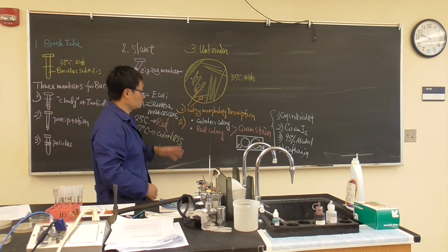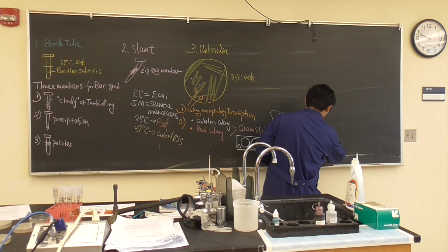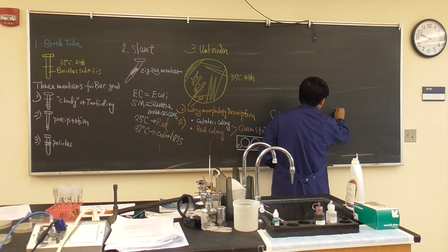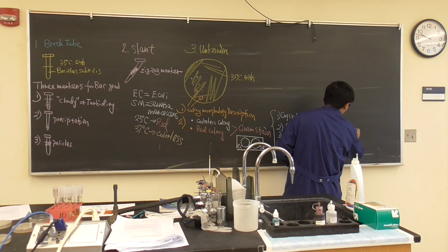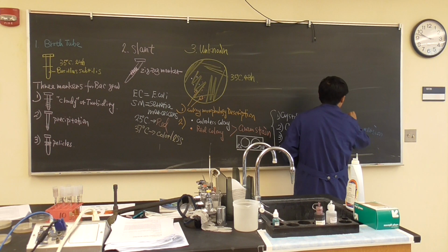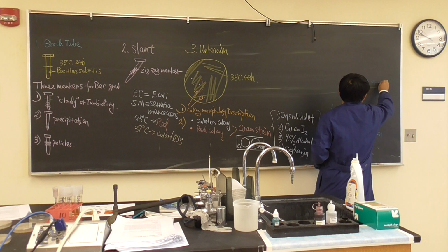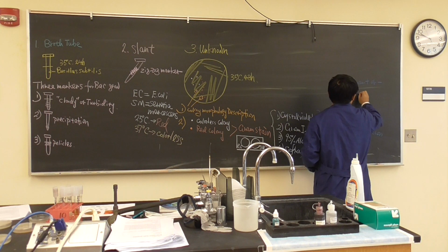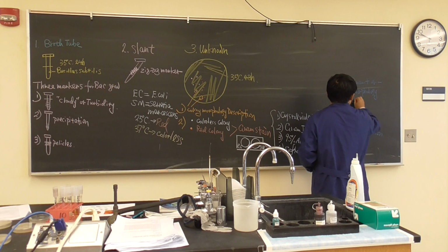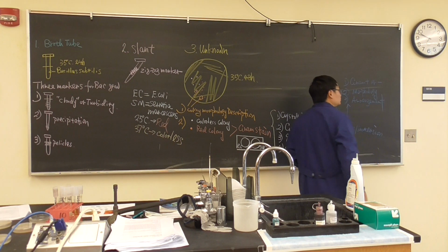Now you're going to tell me the morphology, arrangement, and the Gram reaction. You're going to look underneath the microscope: at 10x you find the specimen, and then underneath 100x with oil immersion. You need to tell me three important pieces of information. Number one, is it Gram positive or negative? Number two, morphology. Number three, arrangement. Okay? You need to tell me.